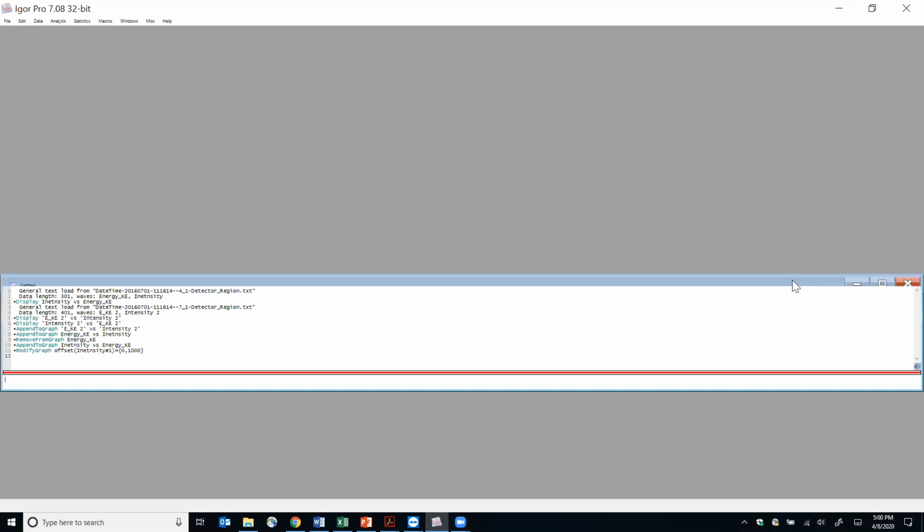This is all that I need for your work. I don't need kind of fitting. I will just give you some data, like in an Excel sheet or text files, and I'd like to plot them. Oh, so you want me to just plot and then that graph looks better than Excel?